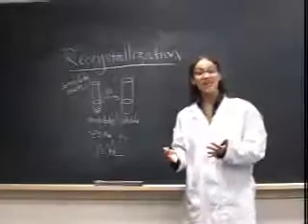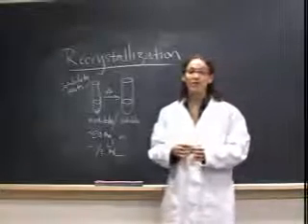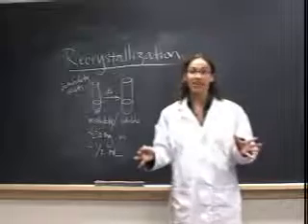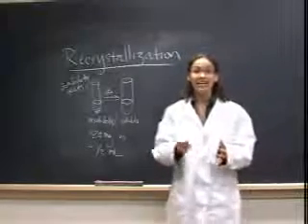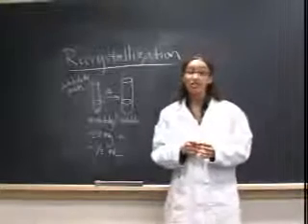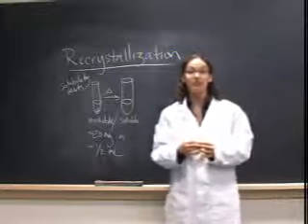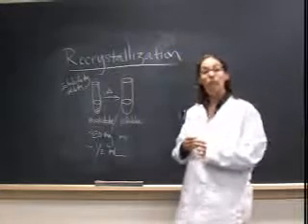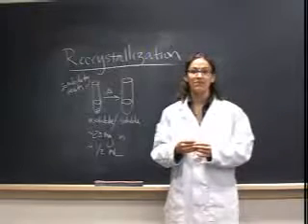A large percentage of a chemist's time in the laboratory is spent purifying chemicals. Learning to use a variety of different purification techniques efficiently and effectively is key to becoming a successful experimentalist. Recrystallization is one powerful method for the purification of crystalline solids. This video will outline the purification of naphthalene by recrystallization.